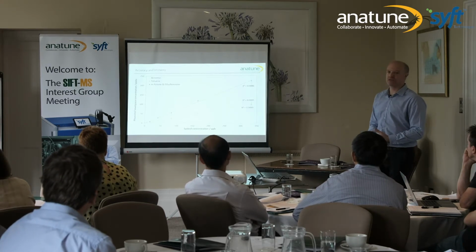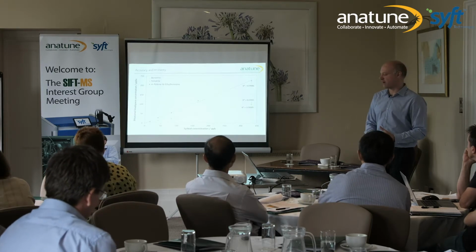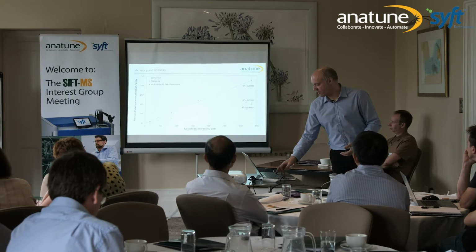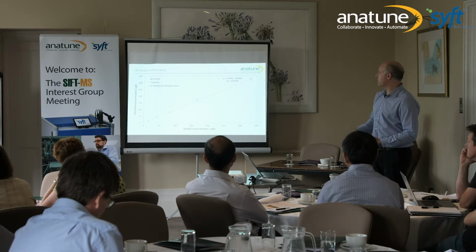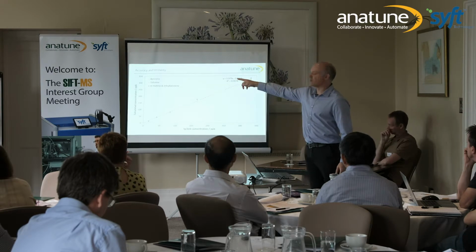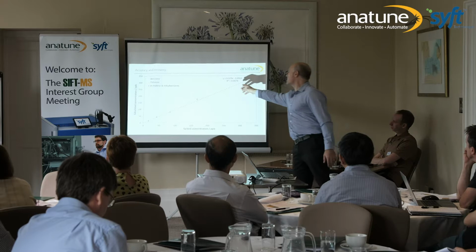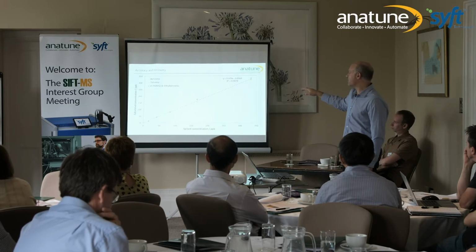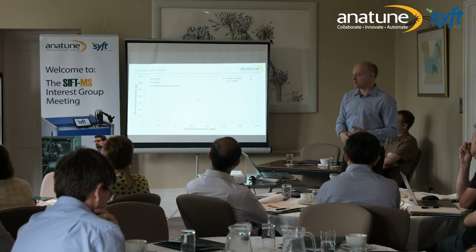So again, the accuracy recovery: if we put it in the matrix, we get a good result coming back out of the matrix again. And just to show that there was a very good one-to-one relationship here, this is all of that data plotted, spike concentration versus calculated concentration from our linearity curve. You can see the slope is essentially 1, so there is a one-to-one relationship, y equals x. So what we put in, we get out according to the linearity and the calibration we're running.